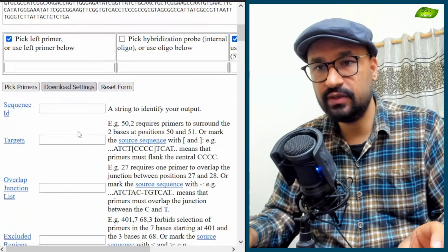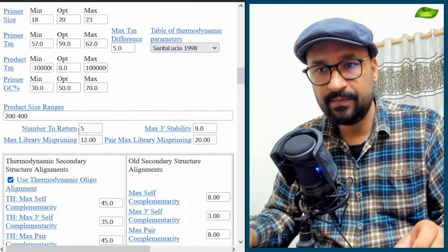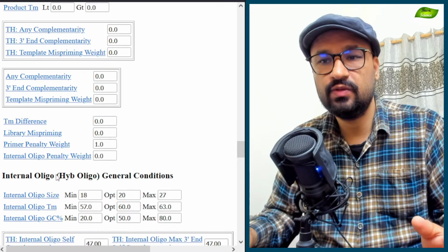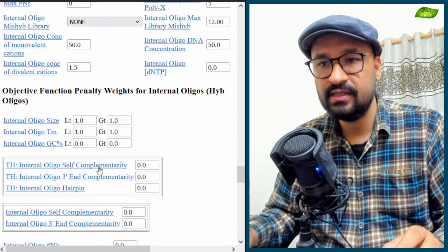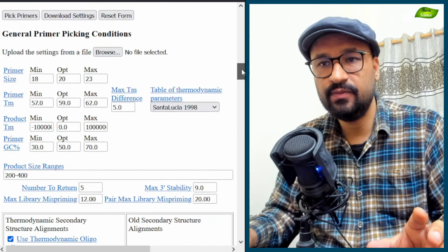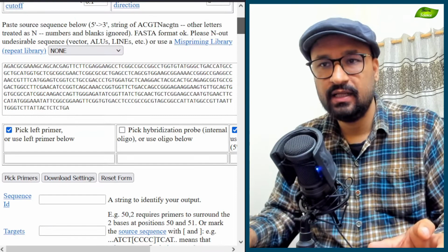If you are not getting that particular specific amplified region, then I don't want you to restrict the Primer3 software to give you some crappy primers. So you can always give some sort of a range, a product range, so that this software can give you primers of high quality. Let's put it that way.